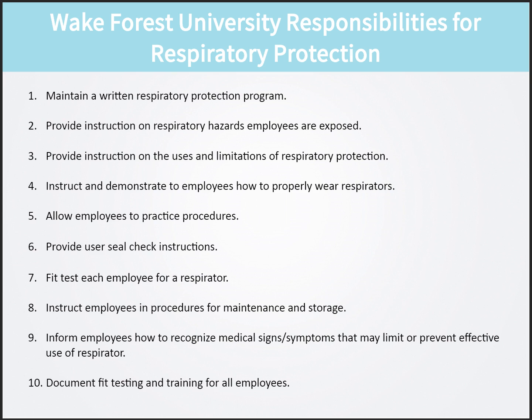As your employer, Wake Forest University has certain responsibilities under the Respiratory Protection Program. It must maintain a written respiratory protection program, provide instruction on respiratory hazards, provide instruction on the use and limitation of the respirator, instruct and demonstrate to employees how to properly wear a respirator, allow employees to practice the procedures, provide user seal check instructions, fit test each employee using a respirator, instruct employees in procedures for maintenance and storage, inform employees how to recognize medical signs and symptoms that may limit or prevent effective use of the respirator, and document fit testing and training.